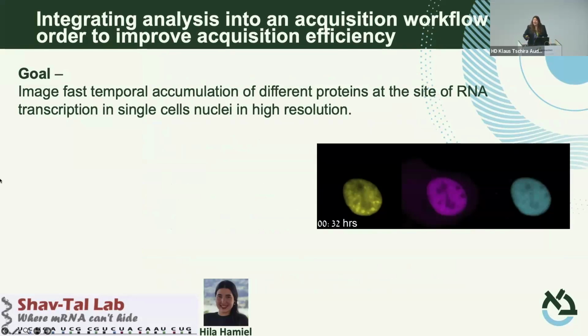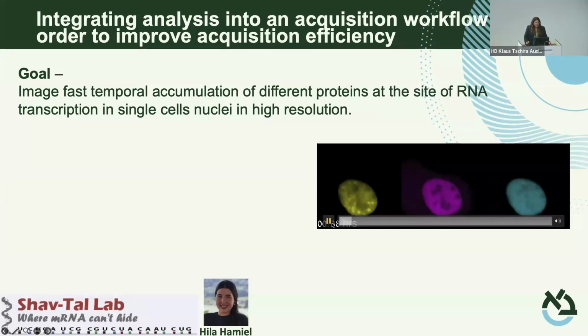So what we are doing in this is actually, I think, unique. We integrated the analysis into the acquisition workflow in order to improve the acquisition efficiency. So I'll explain more. The goal was to image fast temporal accumulation. Okay, this is the movie.